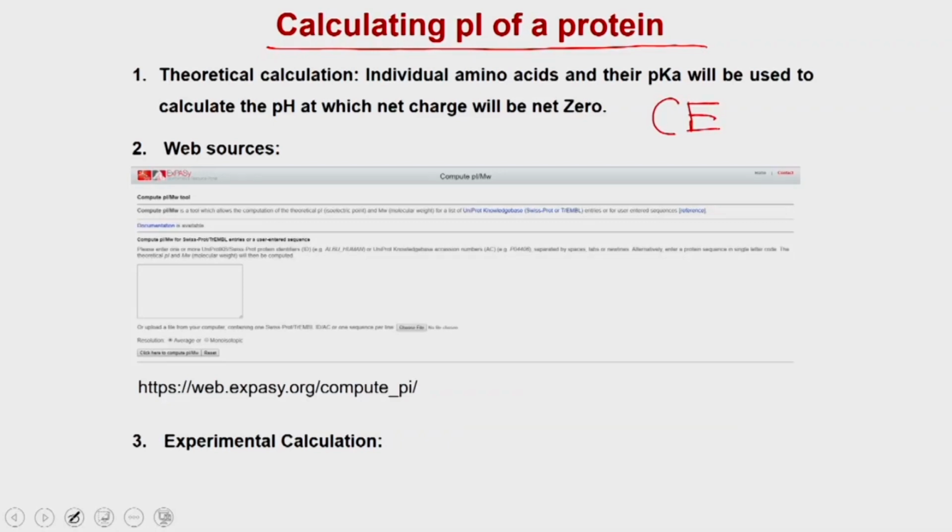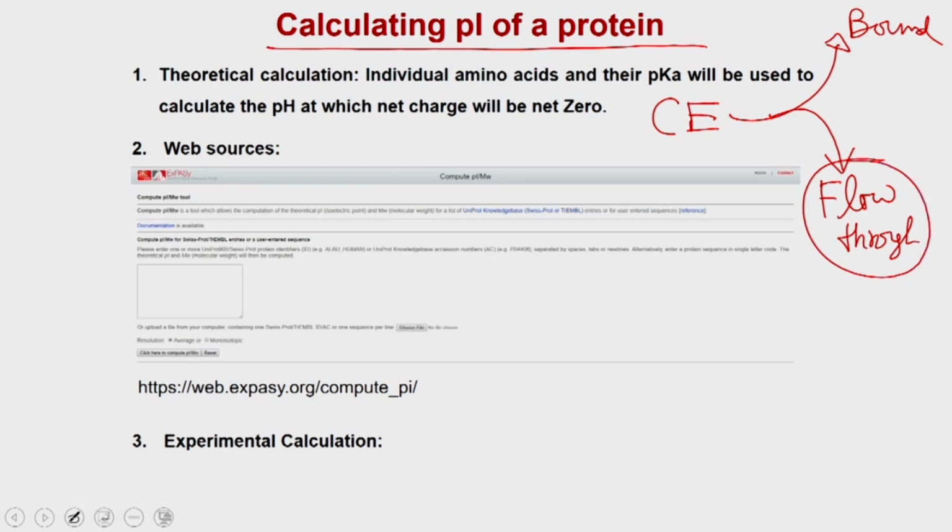Once you load your lysate, you are going to get two fractions: the bead-bound fraction and the flow-through. Since the genomic era was not there, and suppose you are purifying an enzymatic activity, what they were doing was measuring the activity in both of these fractions.